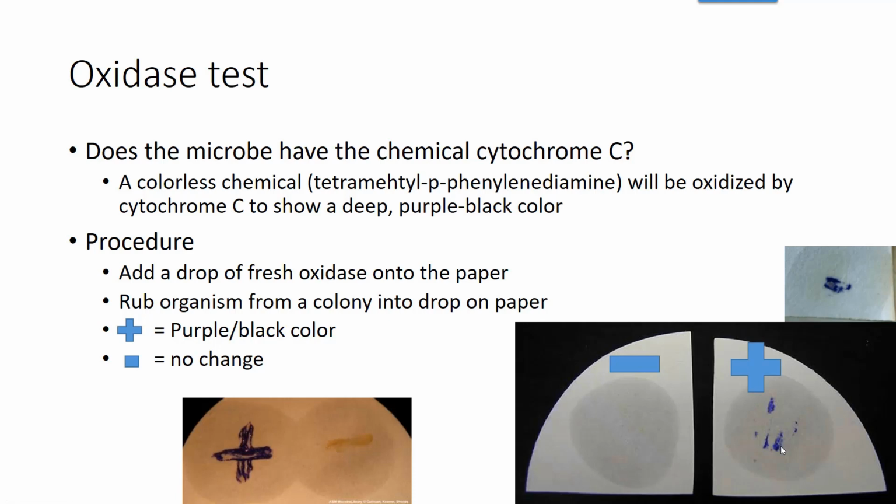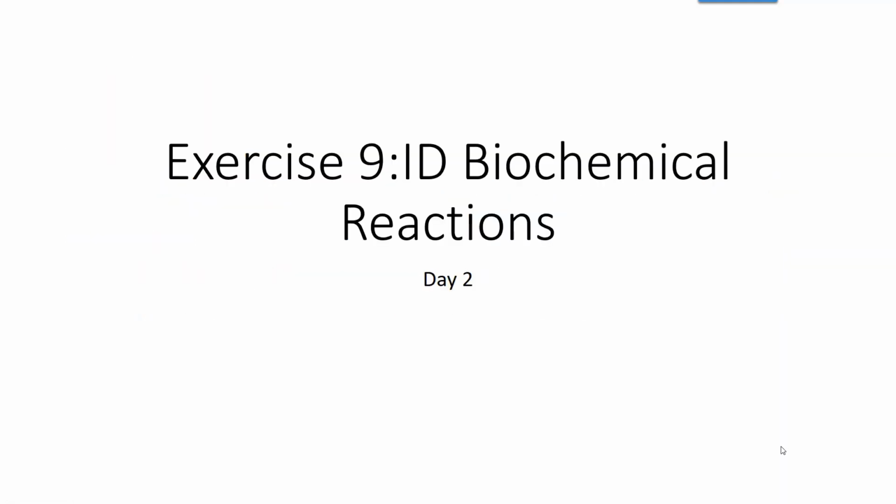Now, after 24 hours, we're going to have some test results. We're going to be able to see some of these different tubes, see their different reactions, and see the color changes that they make.